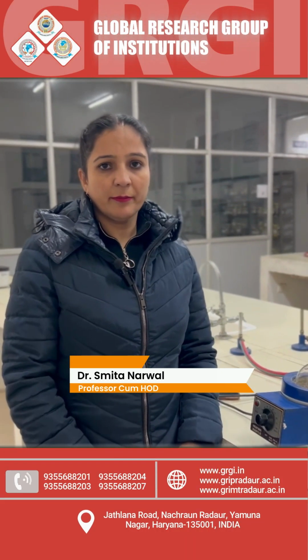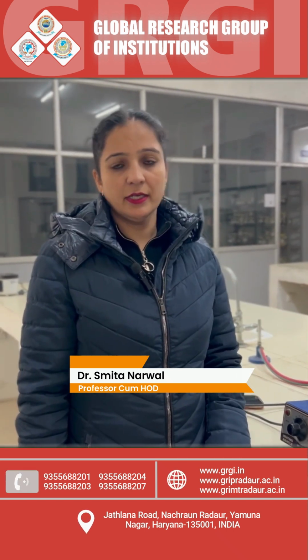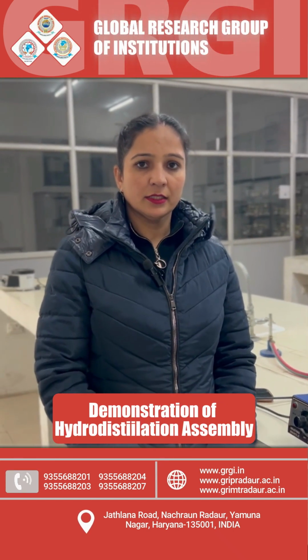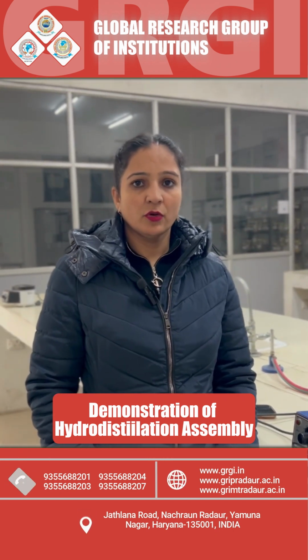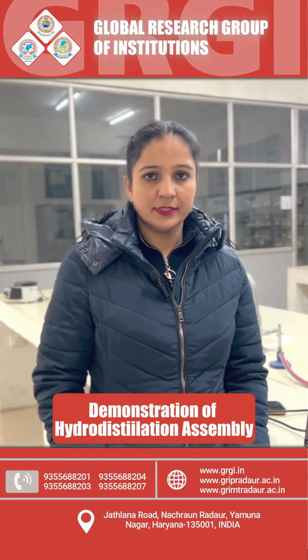Today we will have a look at the hydrodistillation assembly used for the isolation of volatile oils from crude drugs. Volatile oils are also known as essential oils, and these are the chief constituent of a variety of crude drugs like our spices such as coriander, fennel, cinnamon, clove, etc.